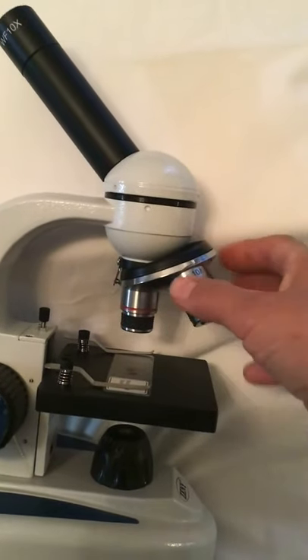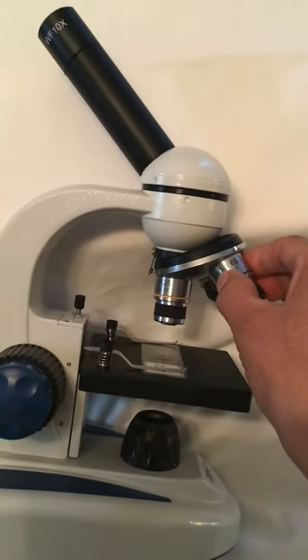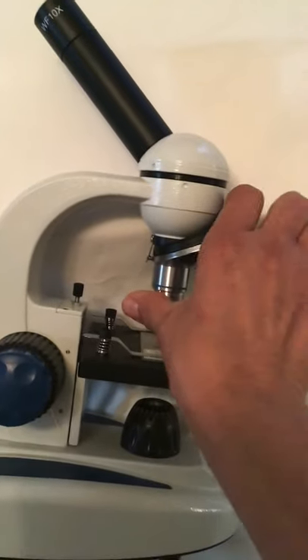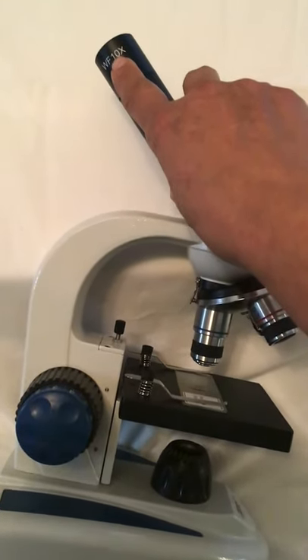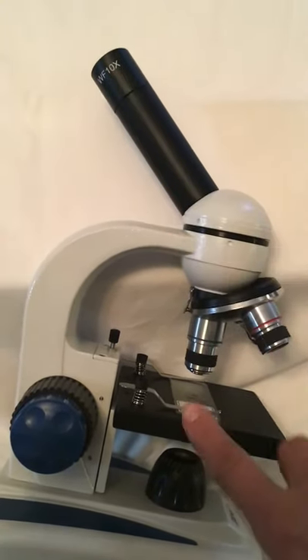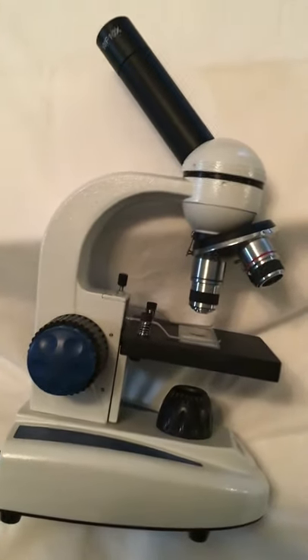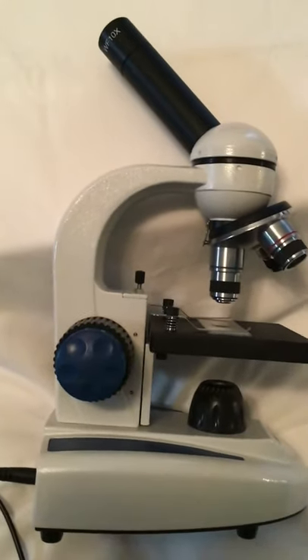Now if you set it at 40x, then it would increase the magnification of that particular specimen by 400 times, because 10 times 40 equals 400 times. And that's probably the setting you will use to get better detail for the cell.